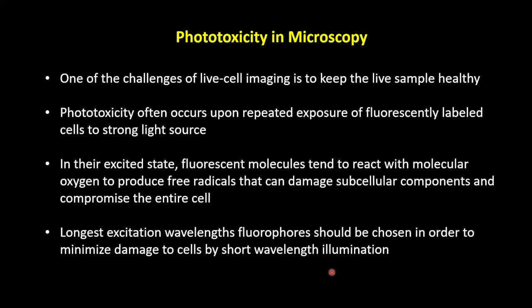Therefore, being gentle with the cell is very important. Usually when you image live cells, you want to use the longest excitation wavelength, which has the weakest energy based on the physics, and it also has deeper penetration into the samples.